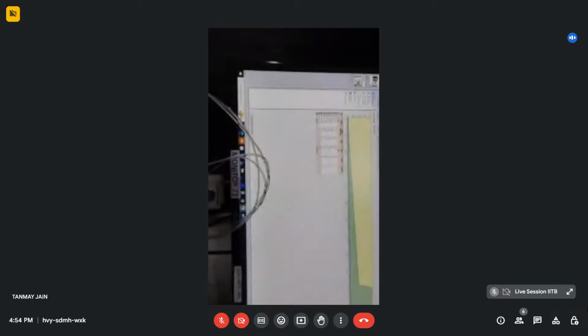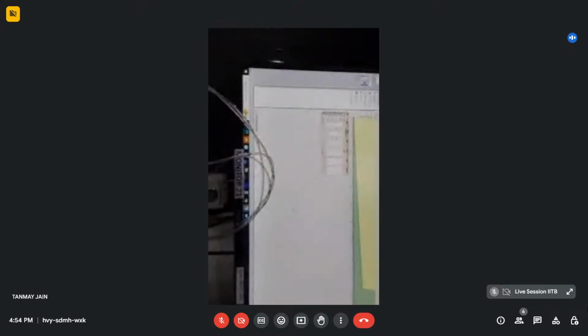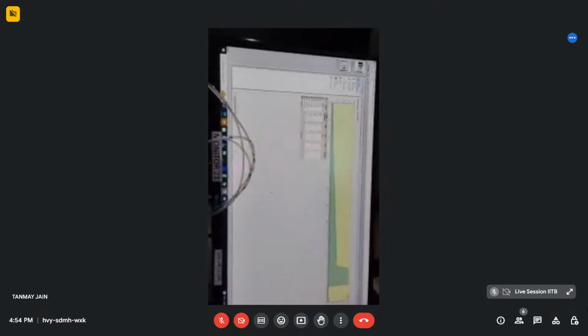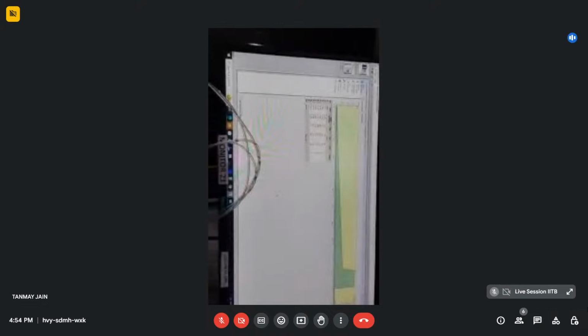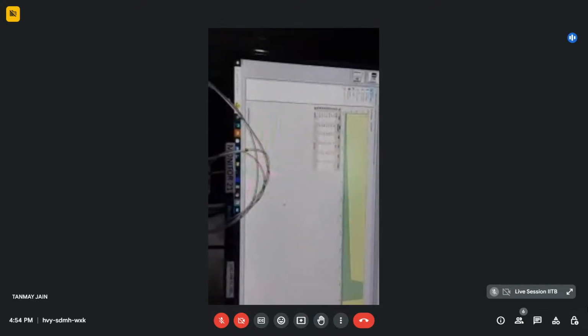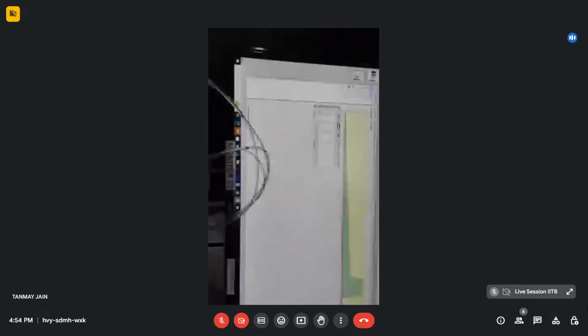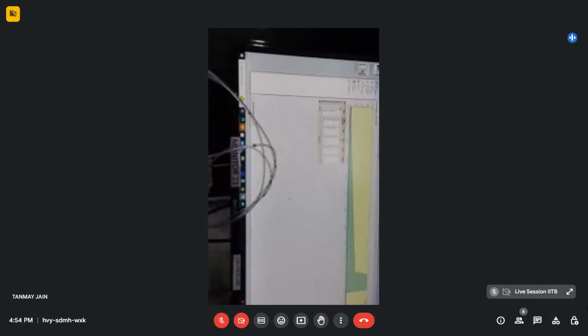So this is just the basic principle, and I would also like to show you the gradient which we were talking about. On the basis of different solvent steps of different hydrophobicity, we tell the instrument what percentage of a particular solvent is mixed to achieve what percentage of medium, which will lead to the elution of the metabolites from the samples. The major goal is to have proper elution of the metabolites over a certain period of time, so that they get ionized properly and also get detected after separation in the mass analyzer.